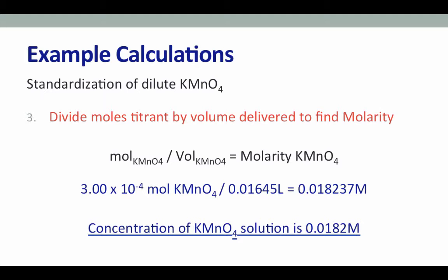The burettes that you will be using have gradations down to the 0.1 milliliter, and so with a guess between the smallest gradations, you should be able to have 2 decimal places in all your volume measurements. You will be deducted points in your lab practical if you do not use the correct significant figures.